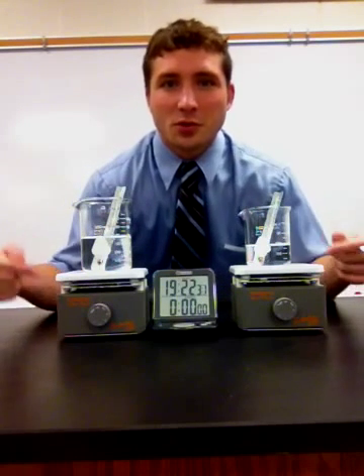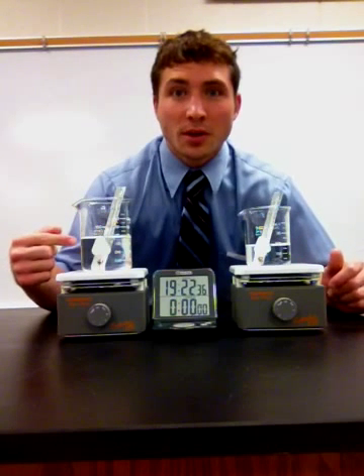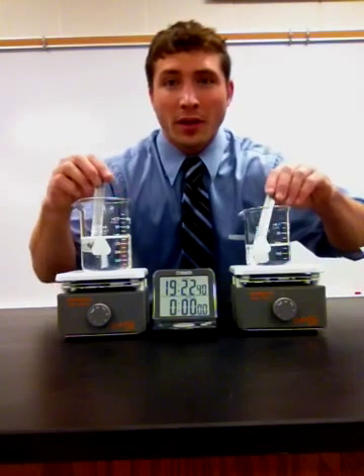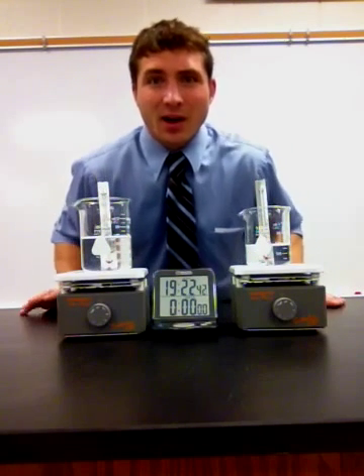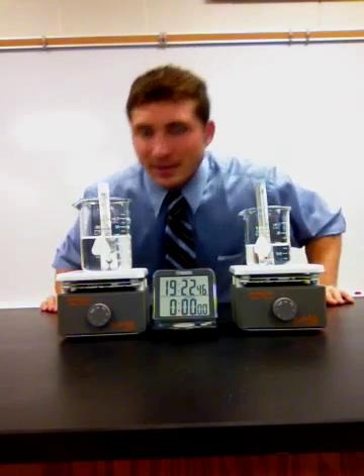I have two hot plates set up here, two beakers. One has 200 milliliters of water, one has 100 milliliters of water. They both have a thermometer, and right now we need to make sure that the temperatures on the thermometers are exactly the same.